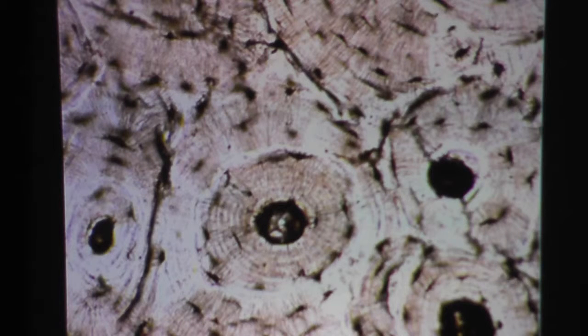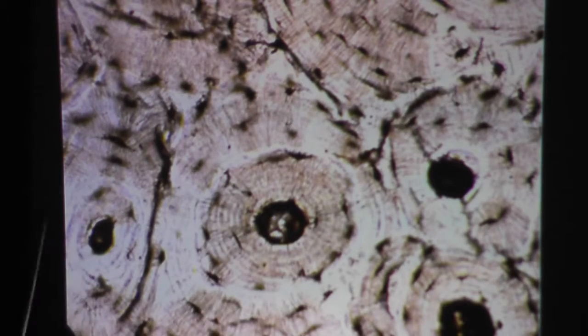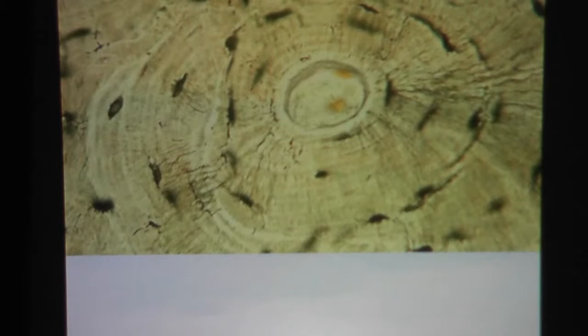Here we have compact bone under lower power, and here's one osteon, another osteon, another osteon, another osteon. Okay, so these would be running into the screen and out of the screen. Here's another osteon all by itself.